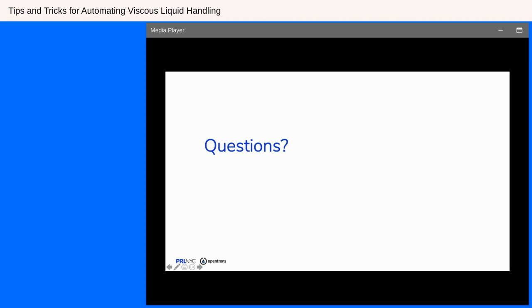So in viscous liquids, use touch tip only when you consider the height you want to use the touch tip at, and use it only when you observe that the liquid droplets are sticking to the tip. This happens mostly in the case of beads, where some droplets are sticking out at the tip. I would recommend using touch dispense instead, where you're moving your tip to the edge of the labware and dispensing completely.